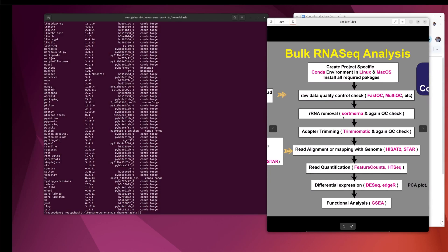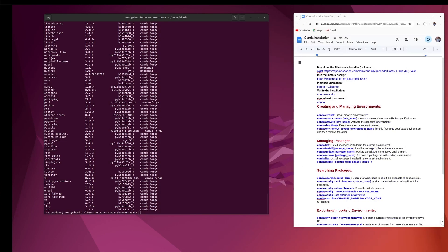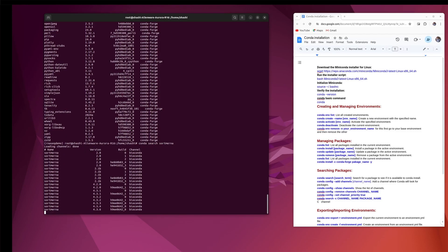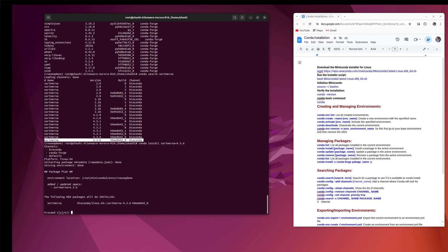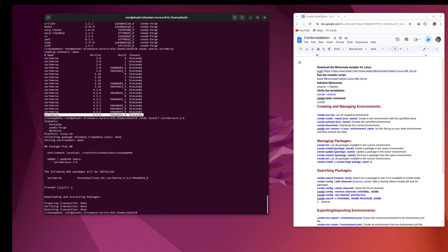Now I'm going to show you how to install SortMeRNA and Trimmomatic. Use conda search sortmerna to find the package, then install the latest version — I'm going to install version 4.3.6. Then search Trimmomatic using conda search trimmomatic and install the latest version.